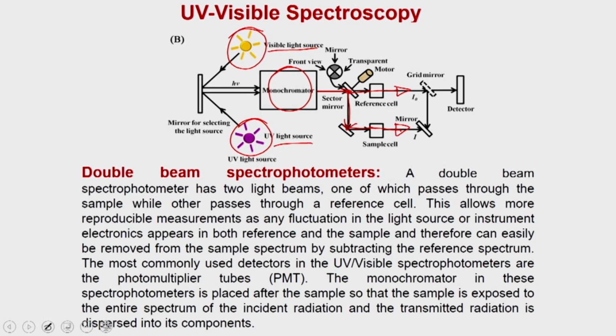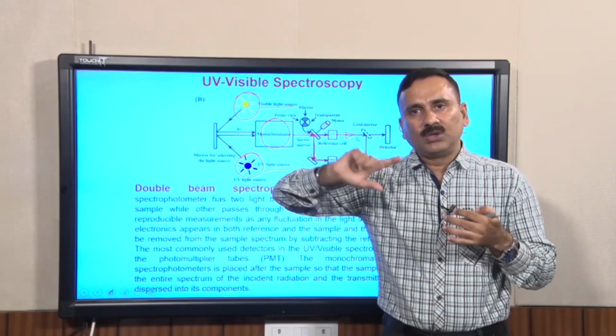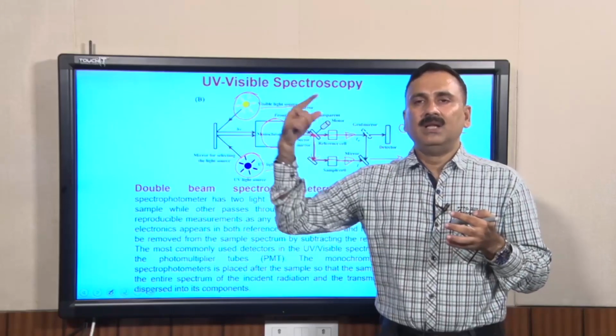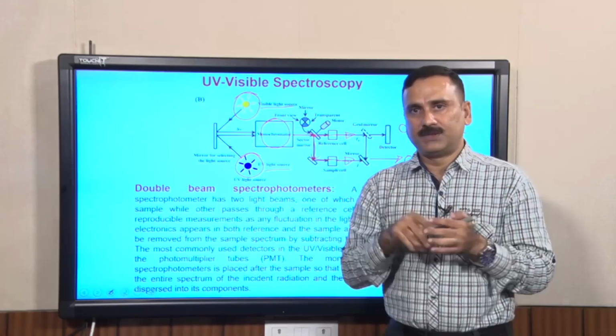Now the problem that the reference sample is not available to correct the test sample's absorbance is not there. If in the beginning it is 0.3 and later on it becomes 0.2, then the sample also, if initially it was 0.4, becomes 0.3. Because in live time it is measuring both, it can do the correction on its own. With the help of the software you can ask it to keep subtracting the reference sample from my test sample and keep giving me the values, and that is going to be very precise.